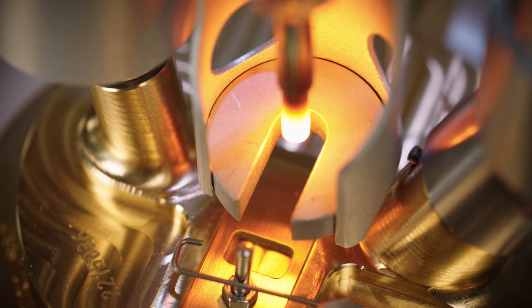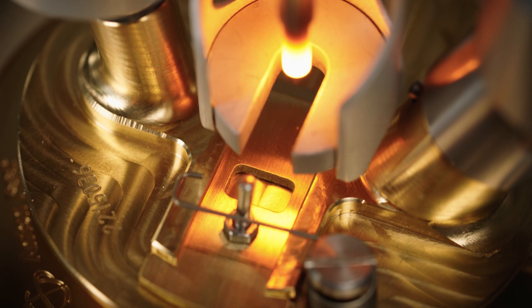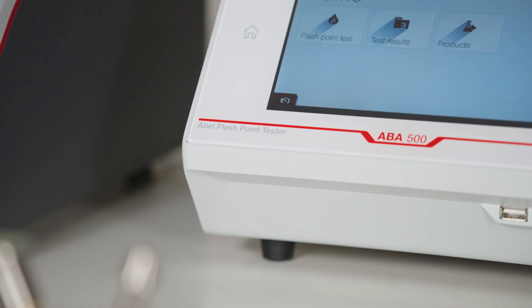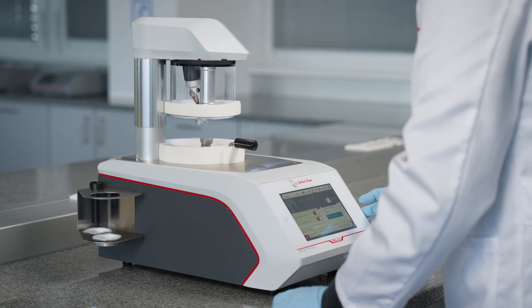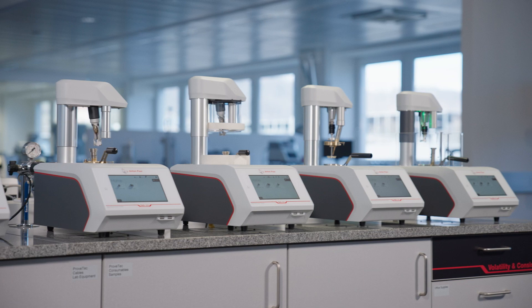Flashpoint testing is essential during production, storage and transport, and when working with flammable materials. With over 150 years of experience in flashpoint testing, we've created an instrument series for your needs.